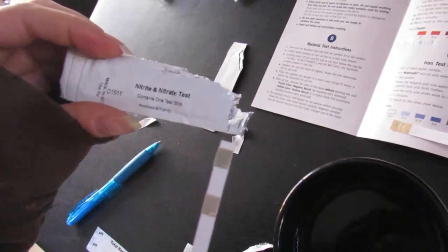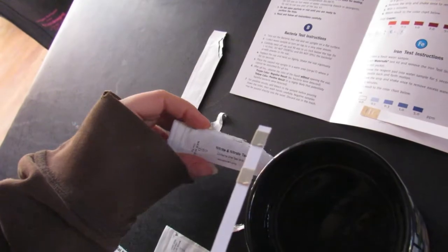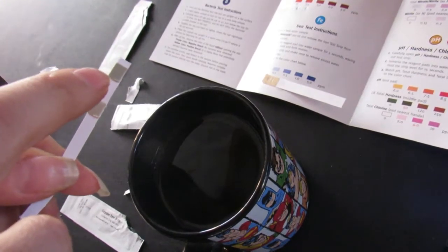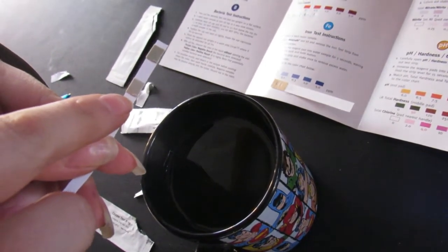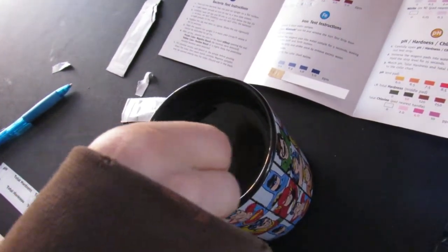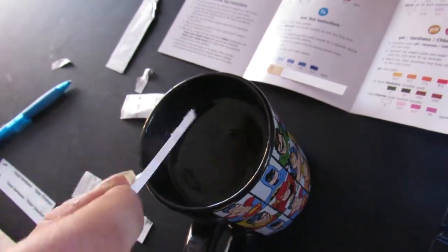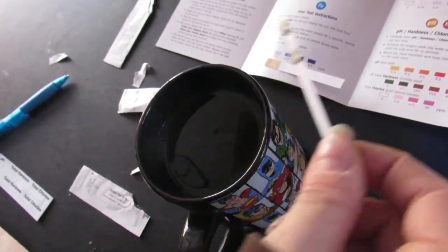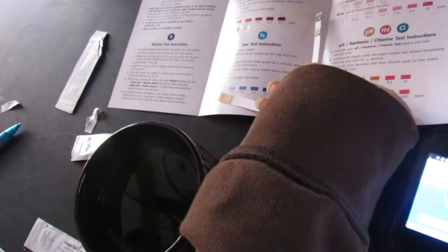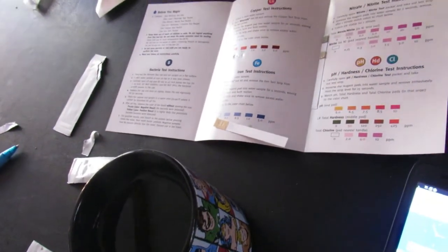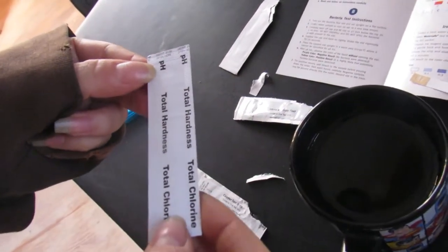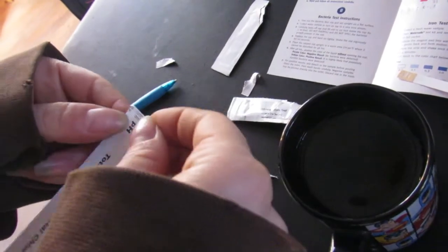Then move on to the nitrate nitrite test. I got the test strip out here. This one is a two second wave. This one has nitrate on the top and nitrite closer to the handle. So I'll start my timer. Two seconds. That's it. That was quick. Take it out. And one minute. And wait one minute.